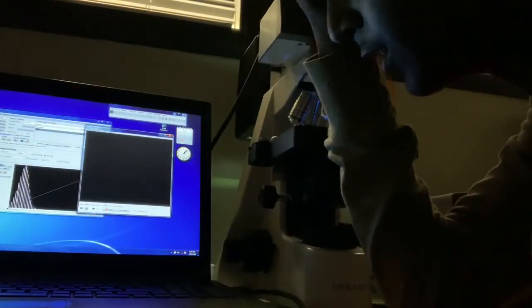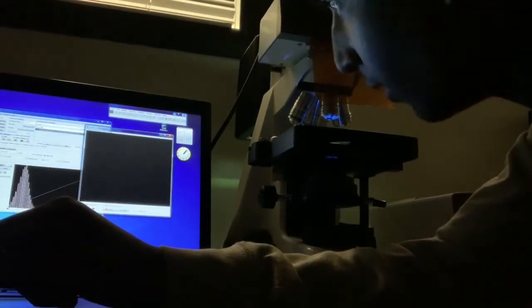Okay. Alright, well I skipped all this part, but you see the basic process. Just keep on messing with the exposure. If it's too dark, you can raise the exposure, and if it's too bright, then you can lower the exposure and then mess with the gain. I'll skip over this part since this might take a while, and this is the first time using these beads.